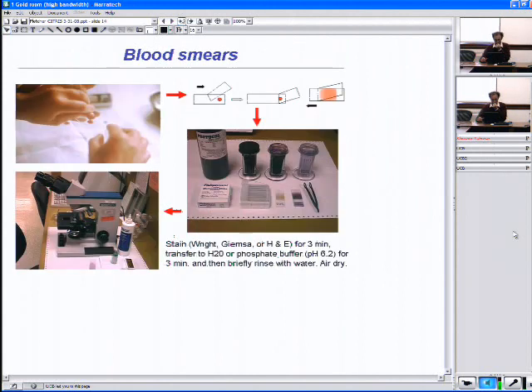One example, and in fact all of the examples, have to start with preparing that sample for microscopy. And the first step is making a blood smear. A blood smear starts with a drop of blood, and it can be a drop of blood from the finger. That's smeared onto a glass slide in an appropriate manner such that you get a single layer of cells that are dispersed enough for you to investigate their shape or their color or their morphology. And then combining that with stains that help to highlight particular features of those blood cells. And then you bring that to the standard microscope in the lab and you take a look at it.